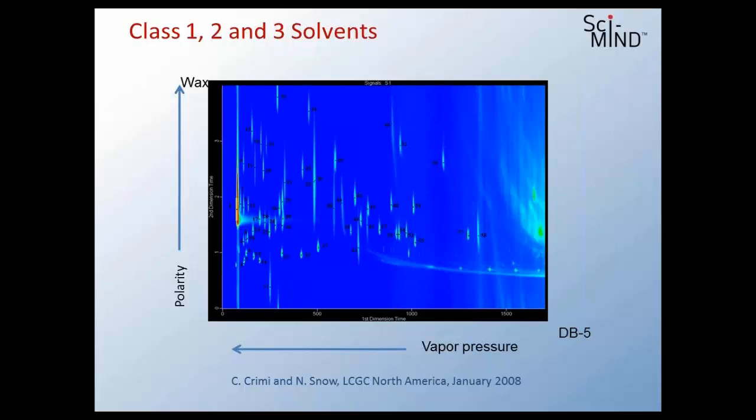What is this an example of? Well, you can imagine it's a bit more of a complicated instrument. It's a bit more of a pricey instrument too. So this is on the triangle. We went for high resolution, so we're a little bit further away from speed. It's pretty easy to use, but we're a little further away from speed there. So this was one where we've now optimized for resolution, but we can't go as fast. Now I'm looking at 15 minutes instead of 2 minutes. Okay, so that's again one of the trade-offs that we make.